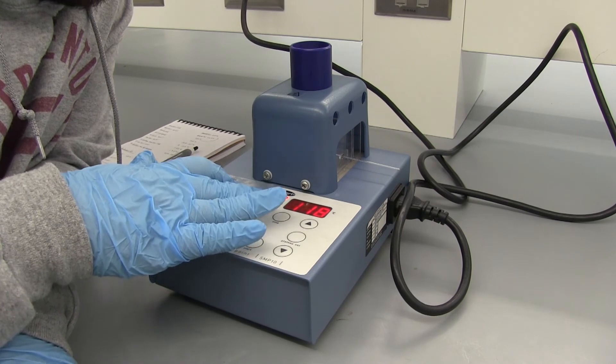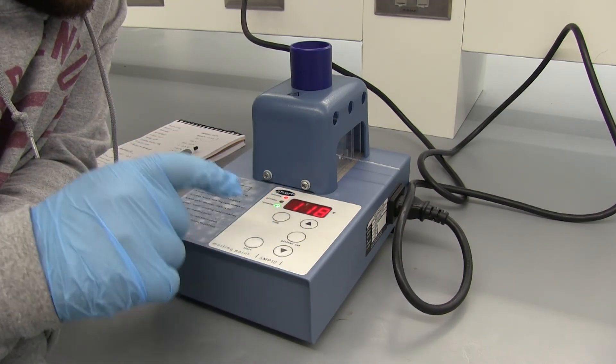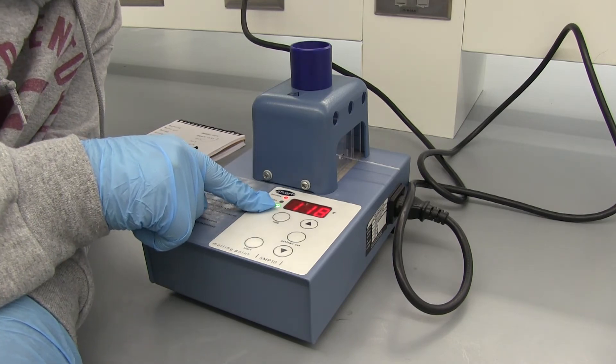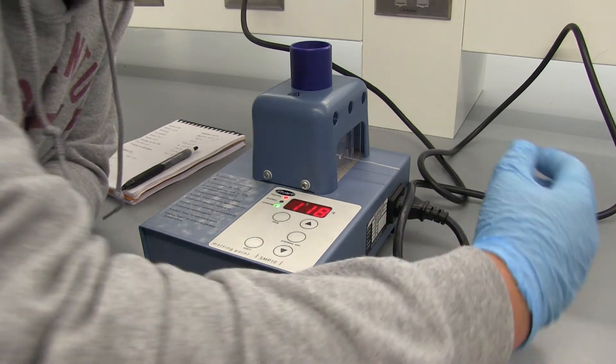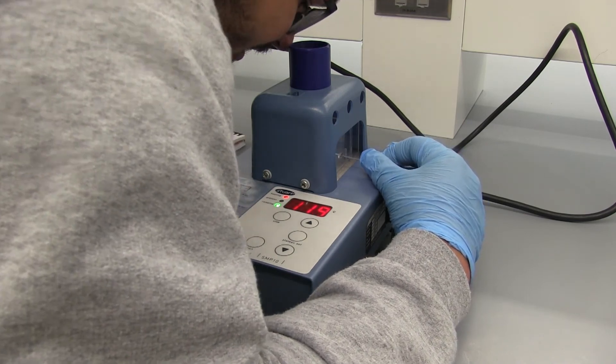Alright so once the plateau light comes on, this orange light here, we can press start again. The green light means it's going to be ramping at 2 degrees Celsius per minute and should just allow us to get a more accurate melting point.